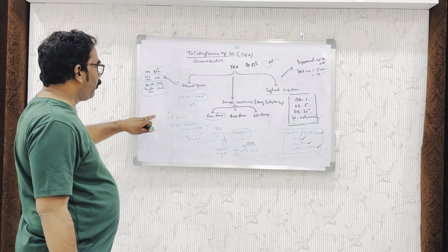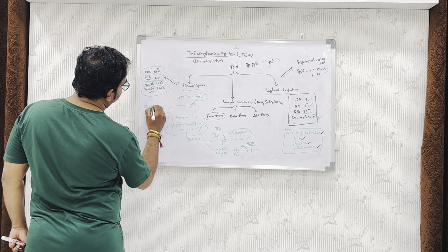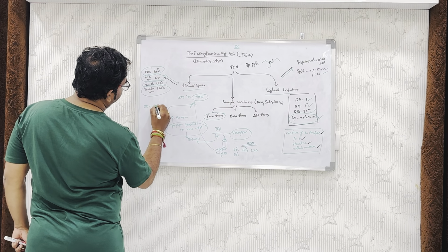How to confirm the method? For example, you inject the standard and you are getting 1000 area. If the sample contains 100 area, then with recovery, meaning spiking of standard solution into the sample, it comes to 1100 area, which means you are getting 100% recovery.